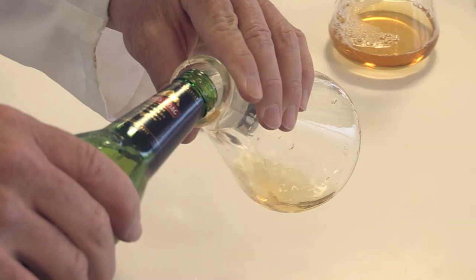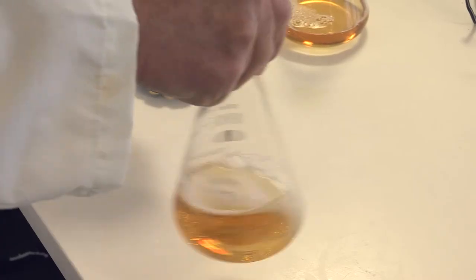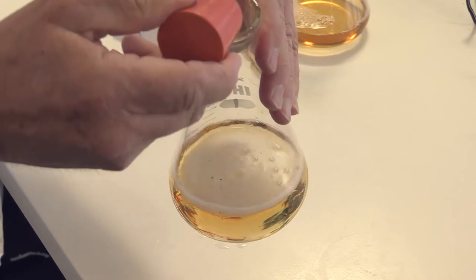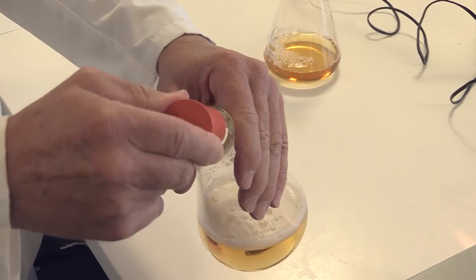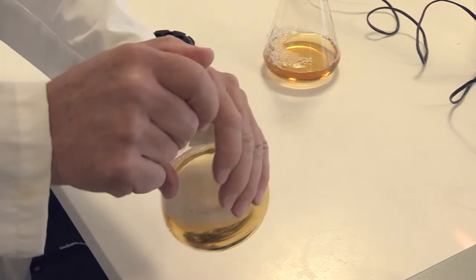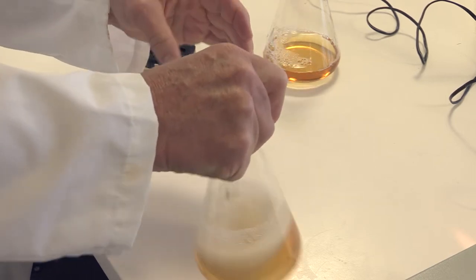The first part of measuring colour is the sample preparation. The beer must be degassed and filtered if hazy. Degassing is done by repeated agitation and release of pressure, and filtration is usually done through a 0.45 micron filter. If your sample is over 27 EBC units you may have to dilute it as well.